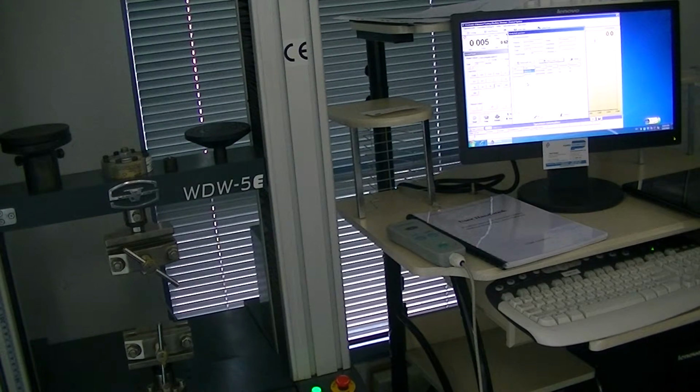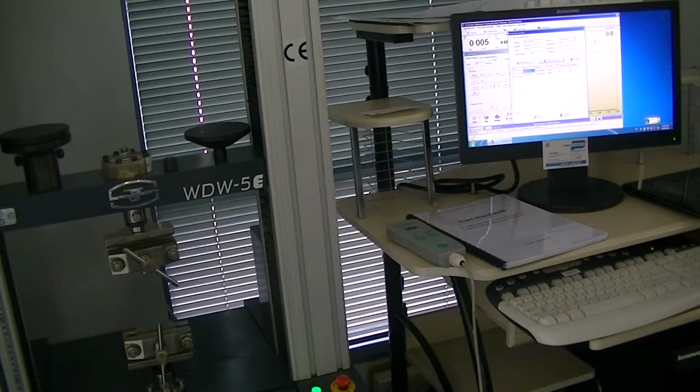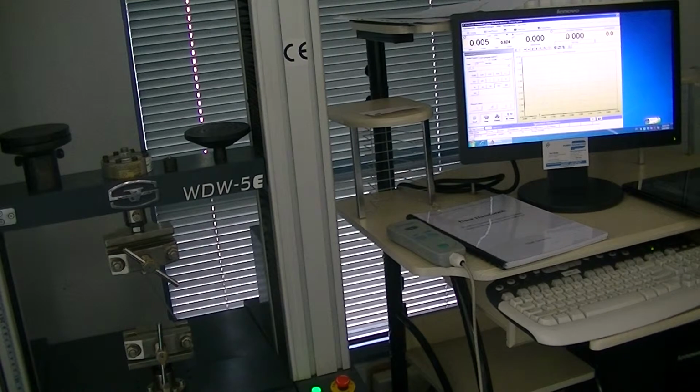Slide number 7. Set appropriate test procedure. In this case, pull apart 100 millimeters per minute. So what we've got here, the test I'm going to do is a pull apart tensile test, and I can put whatever rate I want in here. In this case I'm going to do 100 millimeters a minute. You've got here in our newly built specimen our 2 samples with our length 150 millimeters, which I've entered in. Our width is 1 millimeter, so we click OK to get out of that. We go to the next slide.